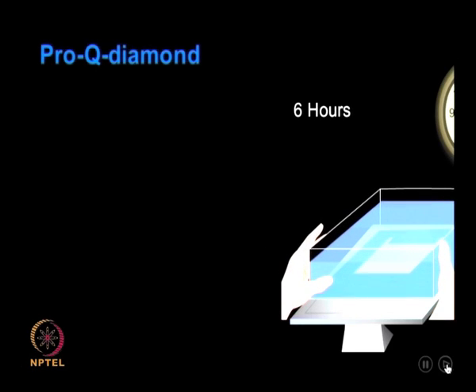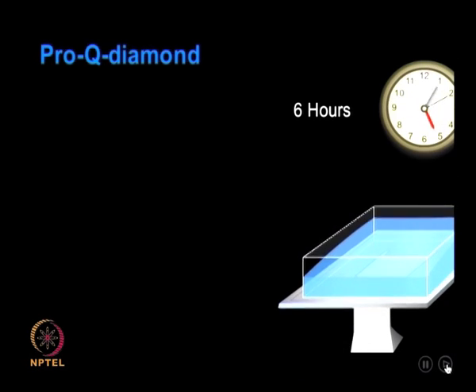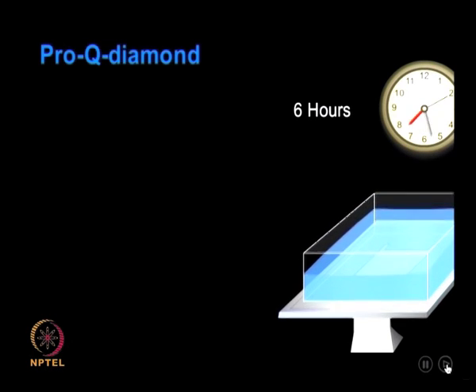For uniform destaining, it is a good idea to keep it on gentle shaking for at least 6 hours.